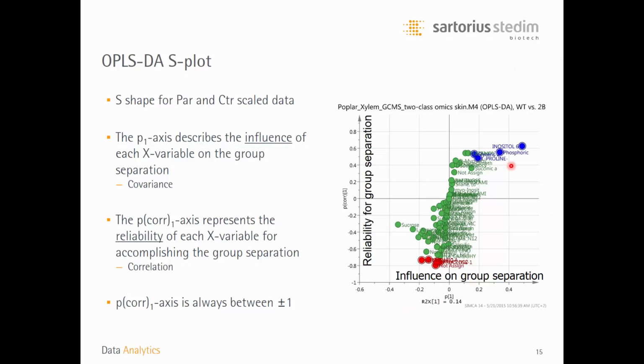And in this example, there are a couple of variables that are marked by the blue color. These are variables, or chemical shift region integrals or mass spec m/z variables, that increase numerically when we go from the control group to the treated group. So they have a higher value in the treatment class or treatment samples compared with the reference or baseline group.